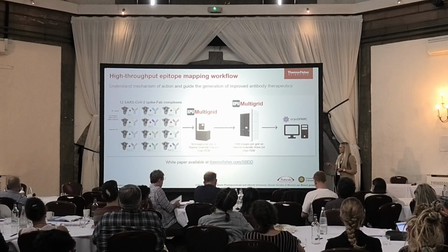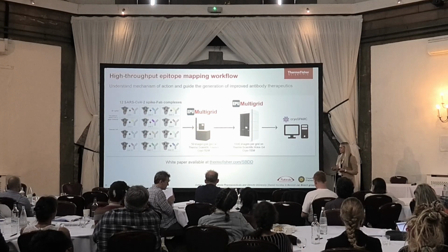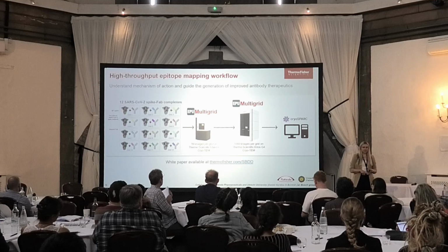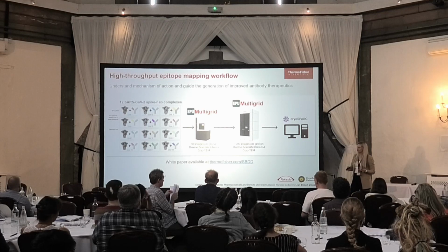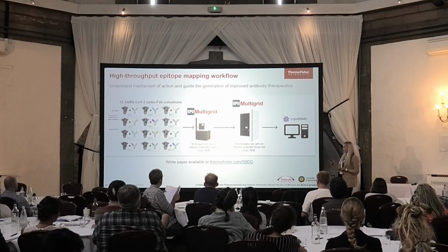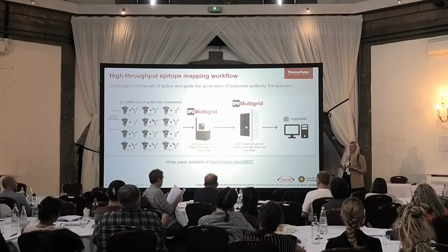in a grid, and then we made just 2 grids per sample and screened them on the Glacios, just 50 images per grid. It takes about 5 minutes just to check that the particles were there and that they were classifying into 2D classes. And then we took the 12 best grids, that's how many fit in the autoloader, into the Krios in the NanoPort in Eindhoven and collected 1,000 images per grid. So with today's speed, that's 2 hours. 2 years ago, it took us 4 hours, but today it will be 2 hours per sample.